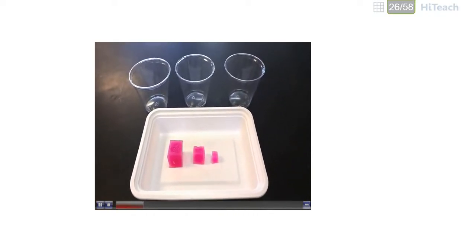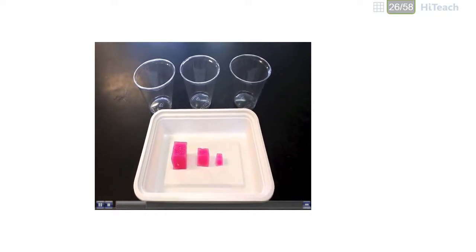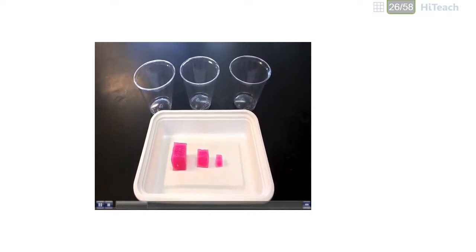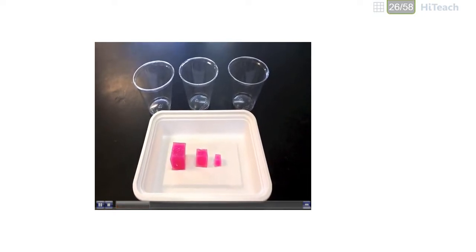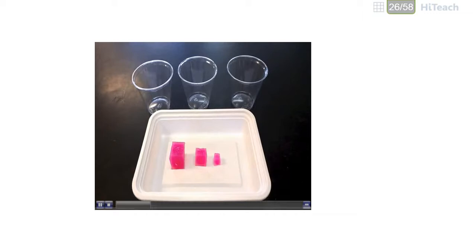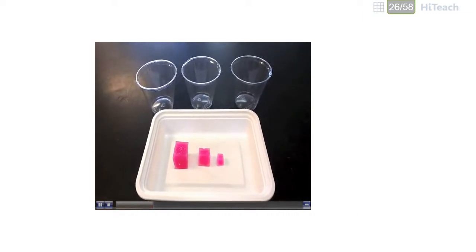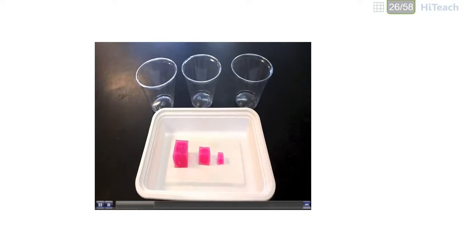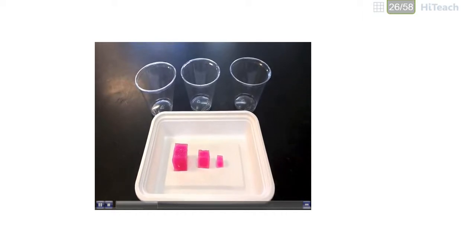You can then take these little cubes and put them into cups filled with dilute hydrochloric acid. You can wait a number of minutes and watch how the acid diffuses through a cell membrane. You can use these to calculate the rate of diffusion, thereby understanding why cells are small and not large.